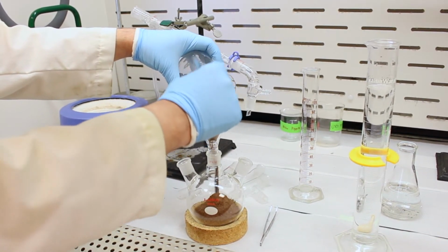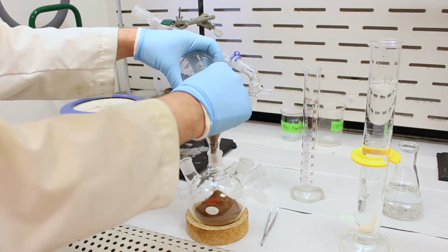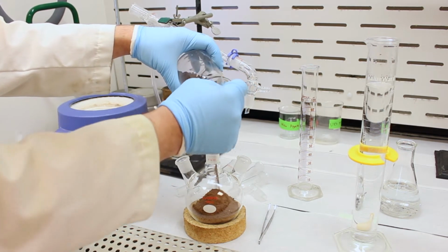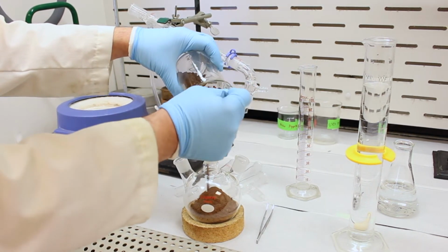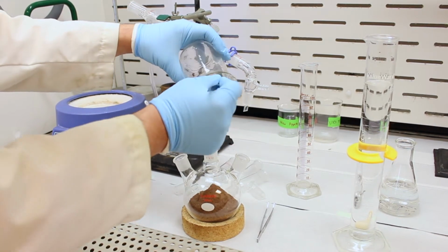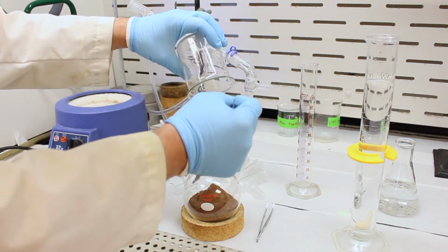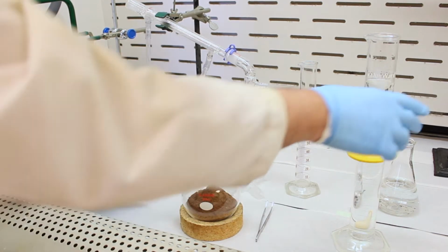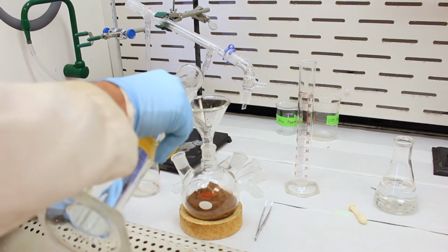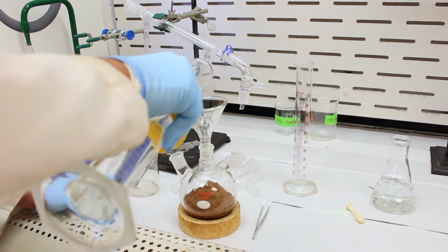So normally in this lab, students would use 15 grams, but because for the second part of the lab, 4 students will usually combine their products. So in this case, because it's only just one of us here, we're going to use 4 times the amount, a total of 60 grams, so that's most of it. Now we're going to add 250 milliliters of water on top of that. The exact quantity is not important.